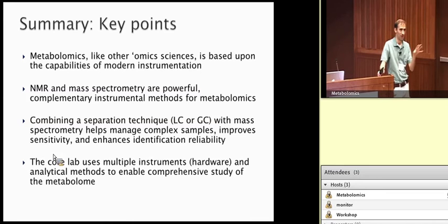So it's a bit of a tricky sort of thing. Basically, it's anything that affects your quantitation negatively, and you have to manage it effectively. And we have methods for doing that with Mass Spec. I know that was sort of a long answer to your question. I'm happy to give you more afterwards if you'd like. Other questions? Yes.